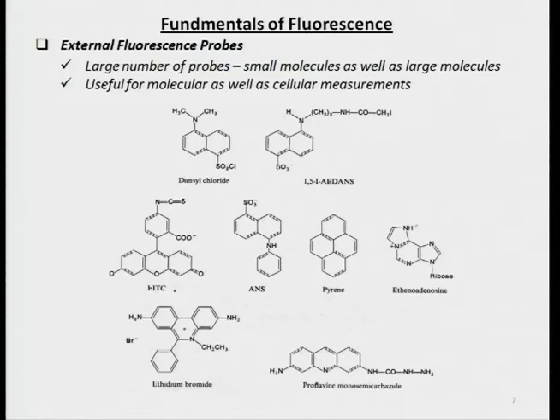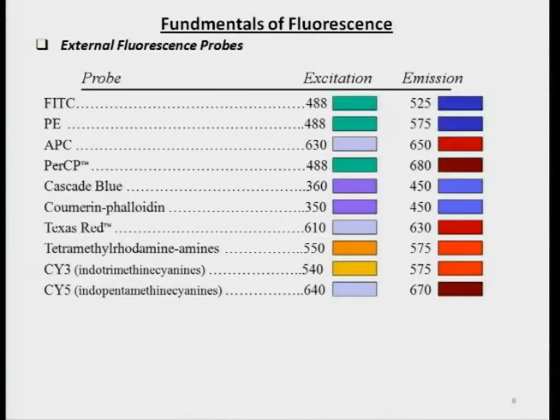There are so many different molecules that absorb in this region, and therefore it is not easy to detect small changes. So if it's completely shifted onto one particular side, then it typically helps. And therefore, we have many of these probes that are useful where the emission is in the visible side.